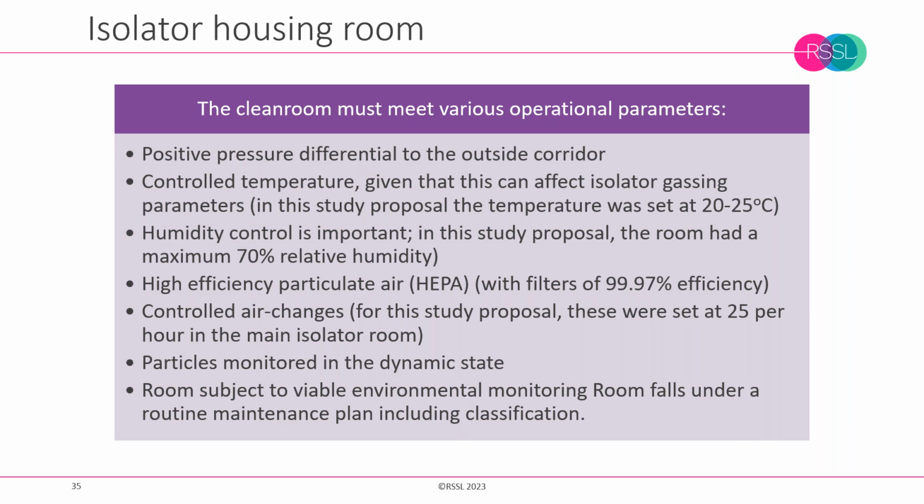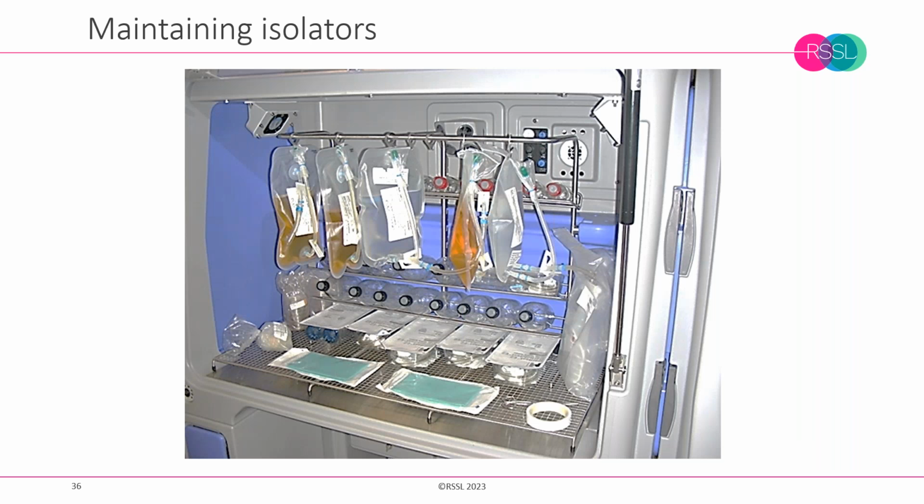And we want to make sure that that is well controlled, and we're not adding an undue bioburden into the isolator, and we're not tracking spores or fungi in, and that operators are appropriately gowned, and that the environmental conditions of the room are consistent, and they themselves are not going to adversely affect the isolator when we're running the cycle. So we don't want extremes of temperature or humidity in the room to adversely affect the isolator cycle.